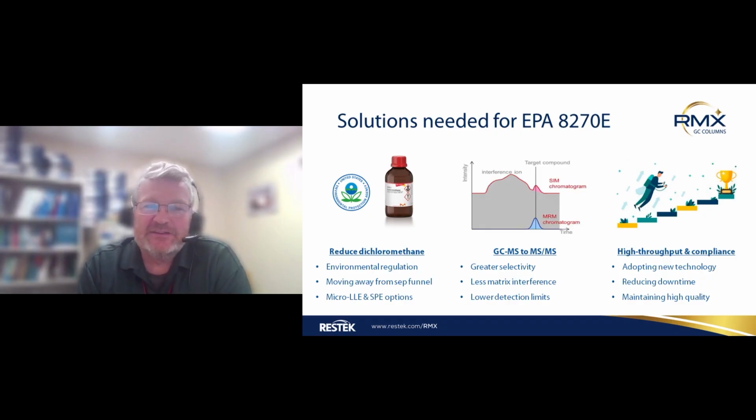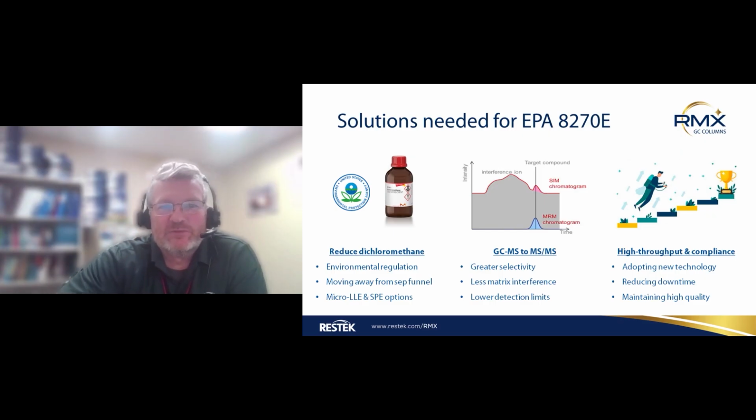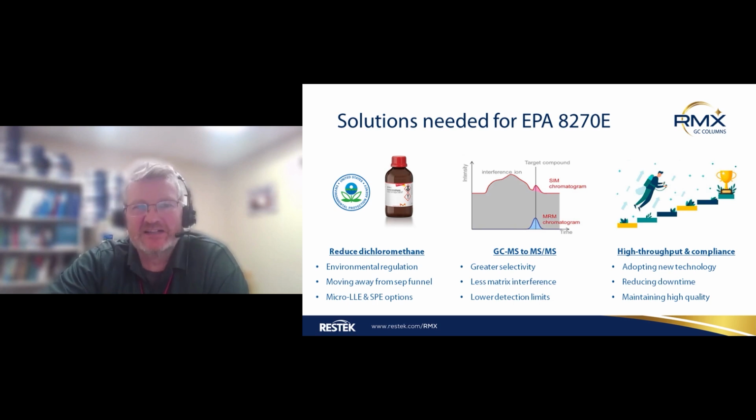So again, the kind of thing that we're looking for is reducing the amount of methylene chloride usage. Currently with the 8270 method, when we do extractions, we're extracting up to 180 mL using a liter of water, which would be our sample. We can drop that down tenfold or more if we can see compounds at lower levels on column. That's the goal for this particular column stationary phase, to be able to see active analytes at extremely low levels, and that's picogram levels on column.